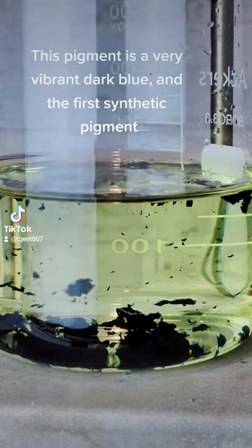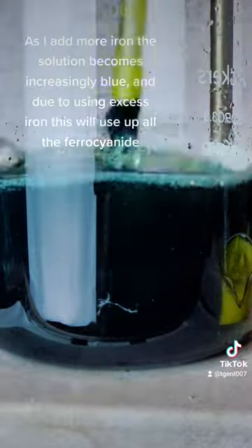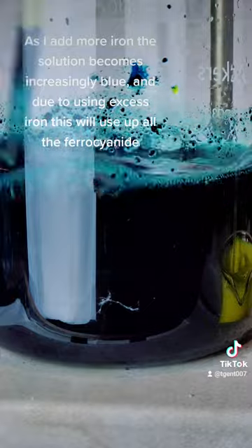This pigment is a very vibrant dark blue and the first synthetic pigment. As I add more iron the solution becomes increasingly blue, and due to using excess iron this will use up all the ferrocyanide.